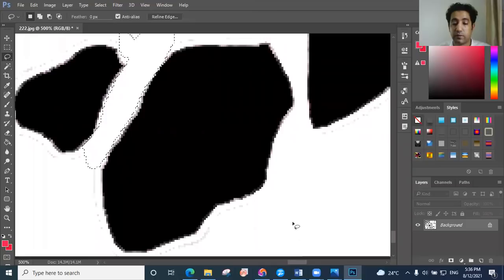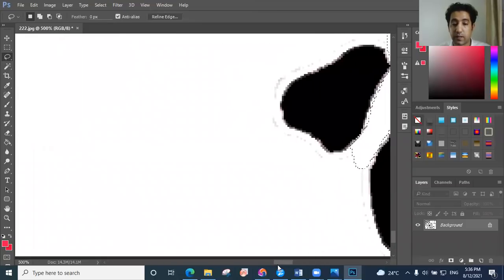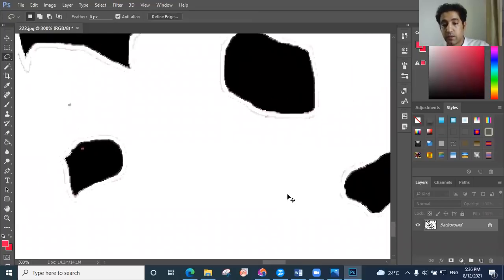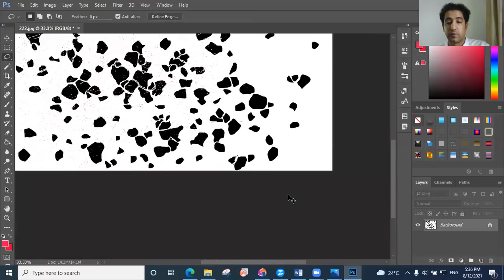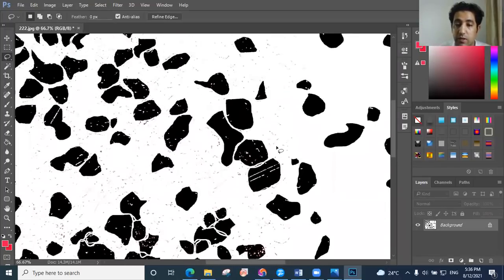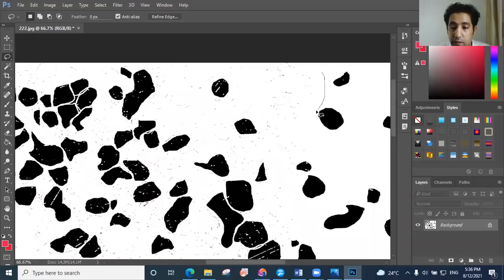All right, we're almost done half. Maybe, let's see, to make it smaller, we already made not even half, a third. All right, just keep going here and clean and be patient.